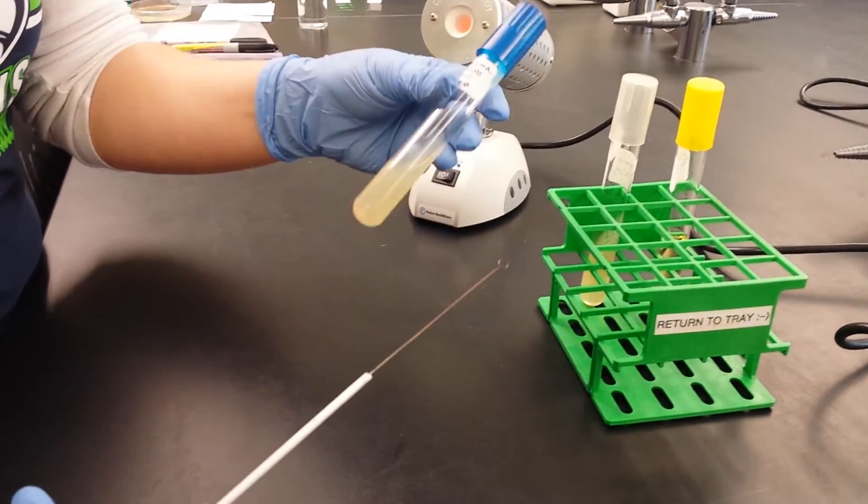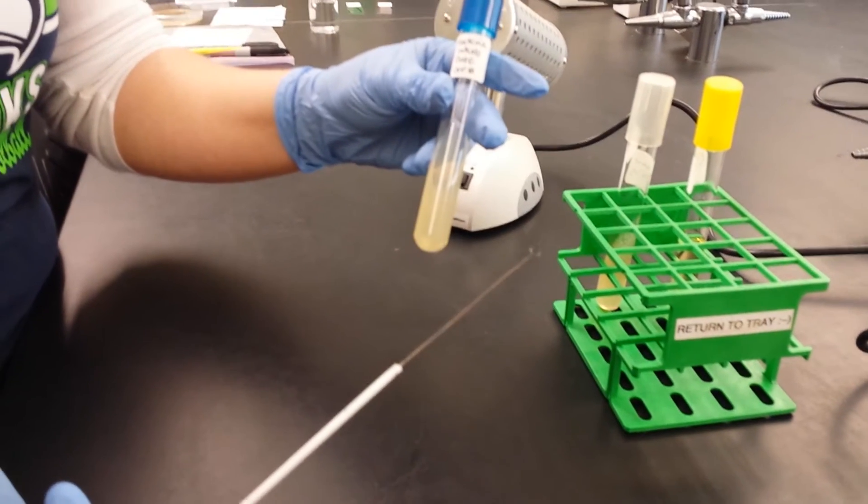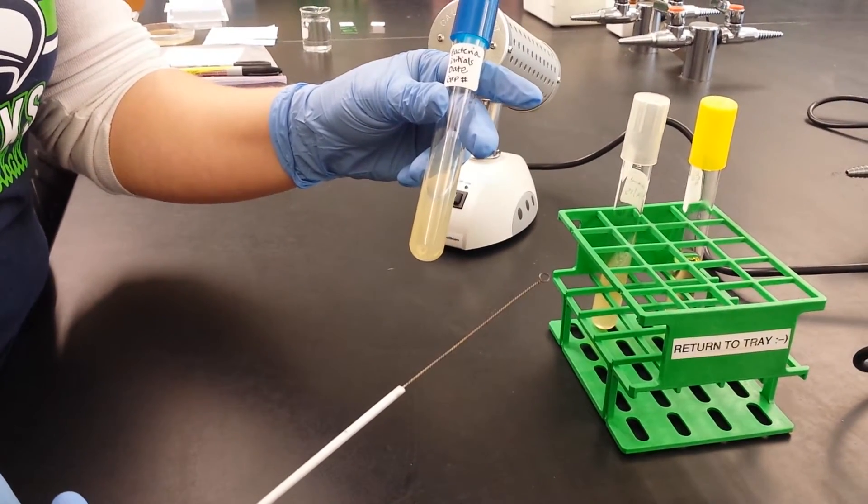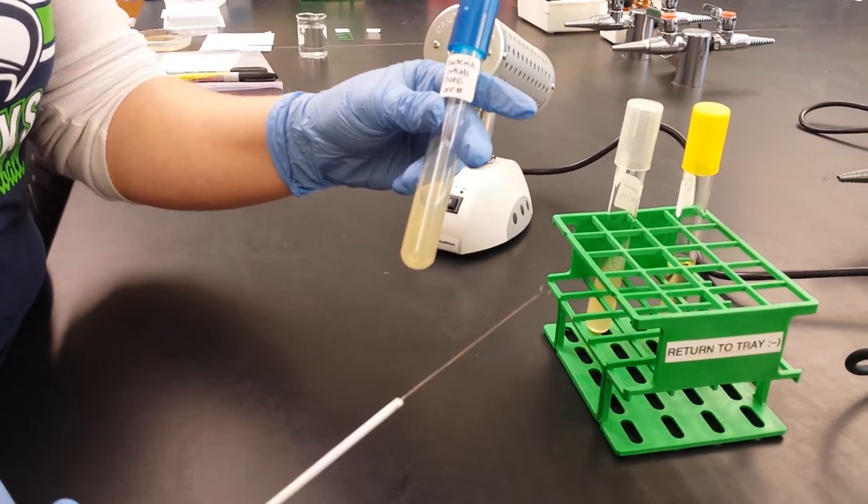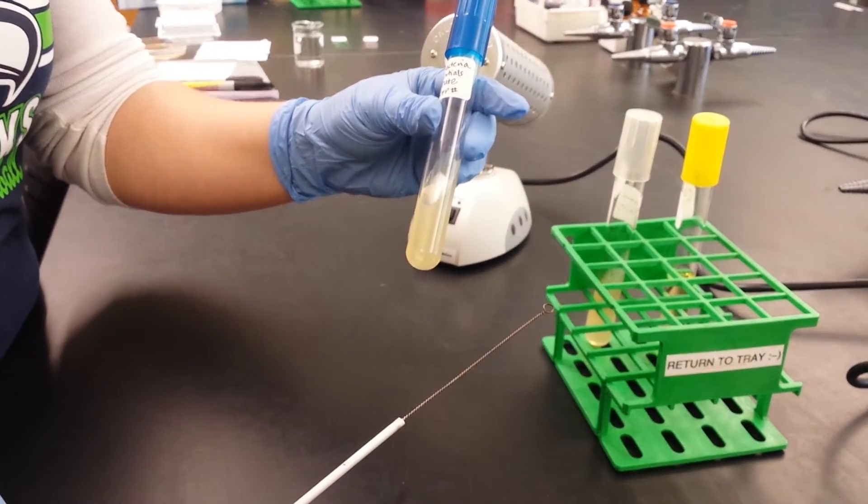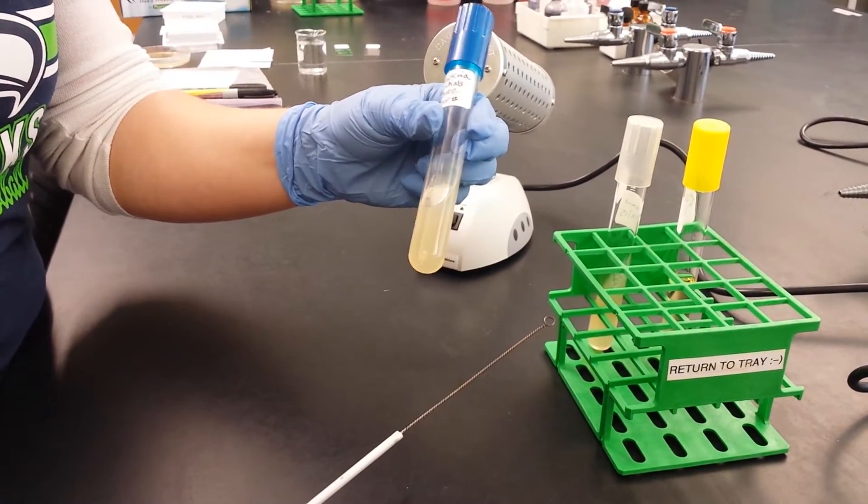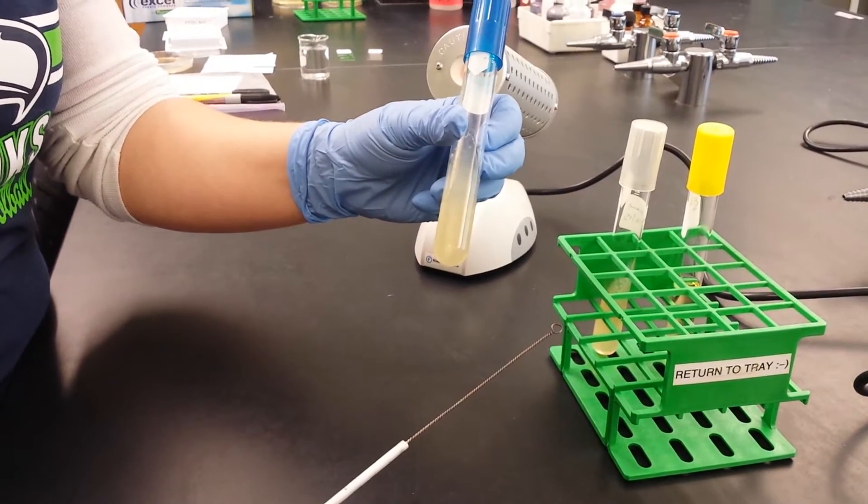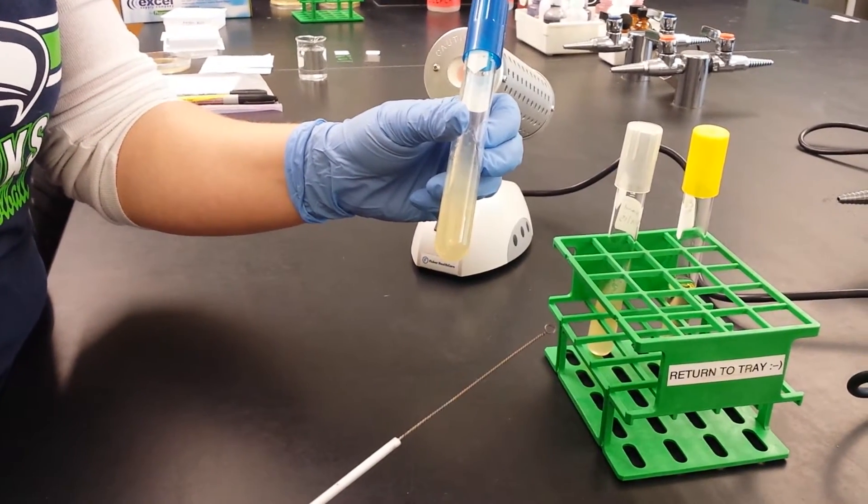Then I pick up my sterile media. And notice I've already put my label on there. I like to do that ahead of time so that I can be quick when I work. And notice also that the label is at the top part of the slant, rather than back here. If I had the label back here, I couldn't see my bacteria growth.